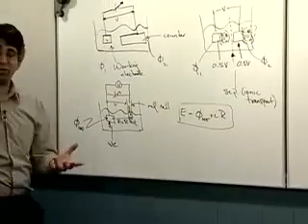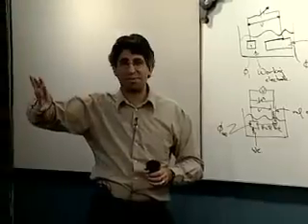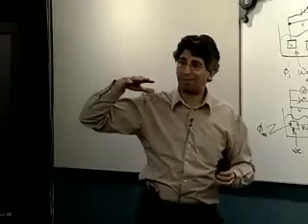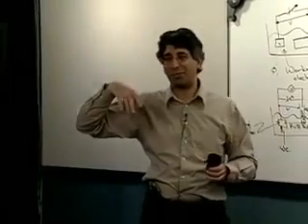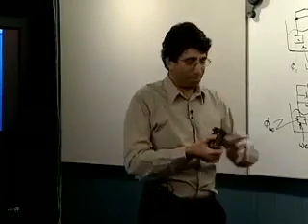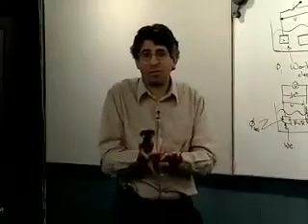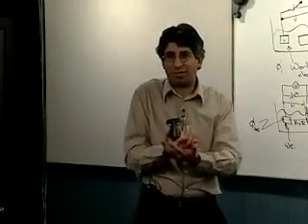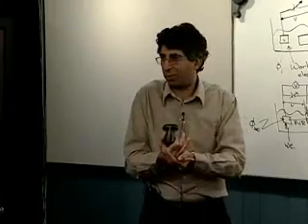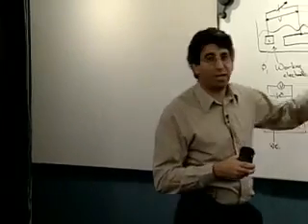And actually, even though I'm joking about this, when I arrived at Princeton, I was kind of scavenging around in the basement where I found some really old equipment. And I found, I guess, an early prototype of a potentiostat sold by Fisher. Yeah, big, heavy steel box, huge thing. I opened it up to see how in the world it worked. There was a date on it: 1950. How in the world in 1950 could they build a potentiostat? As you'll see in a second, they're built with integrated circuits. They didn't have those in 1950. And this is how they did it.